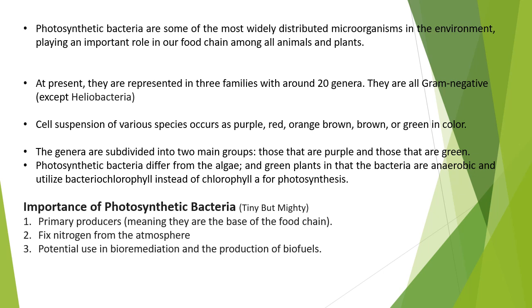So when we read about photosynthetic bacteria, the first name that comes to our mind is cyanobacteria, right? But that is not just one example. There are many different photosynthetic bacteria present in our environment and we need to study them. So for that purpose, you have this practical in your syllabus. Depending on the material available or the syllabus, you might have just cyanobacteria to study, or you might have purple sulfur bacteria or green sulfur bacteria or purple non-sulfur bacteria, etc.